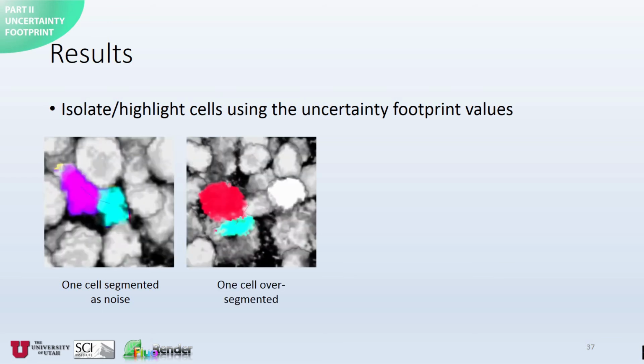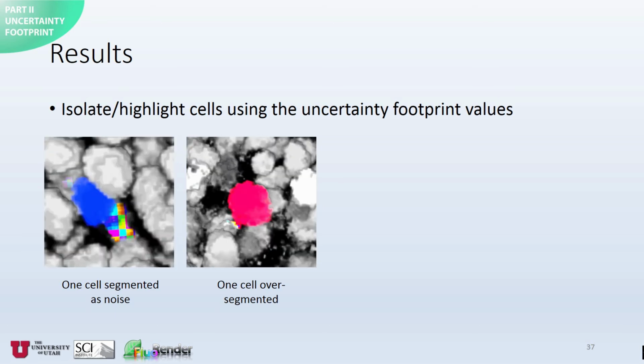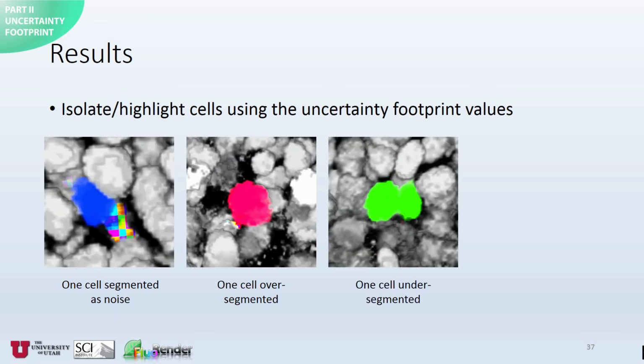The second example identifies an oversegmented cell in the second time point. Although the cell in the first time point was tracked to both parts in the second time point, the result is uncertain. Similarly, the third example shows two cells undersegmented and fused in the first time point. The conflict of matching the two cells in the second time point caused many edge flips.